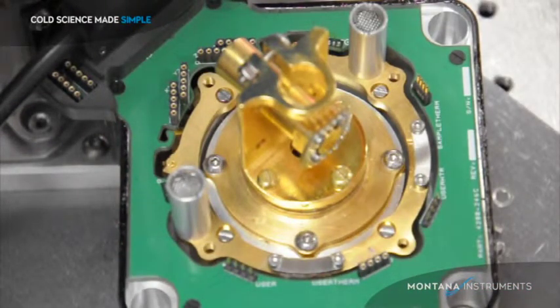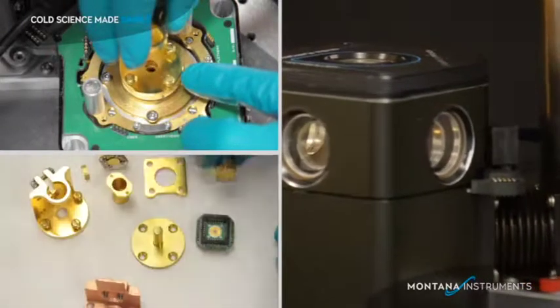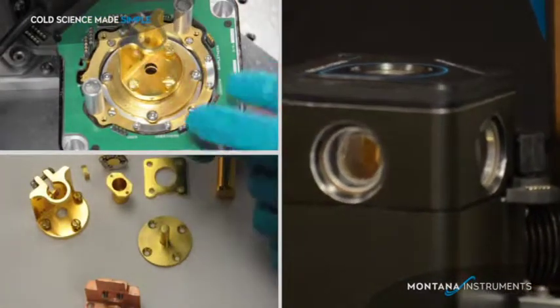That's it. That should give you a good idea of how easy it is to configure the sample mount for your experiment. Please call us if you've got questions. At Montana Instruments, we make cold science simple.